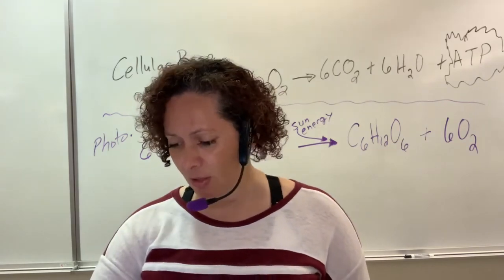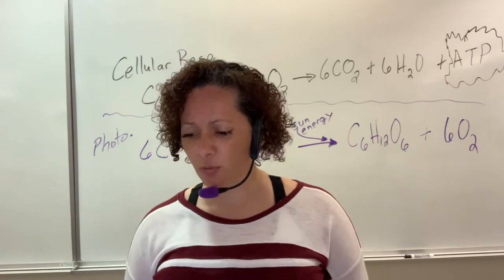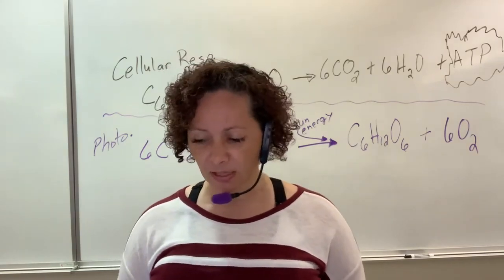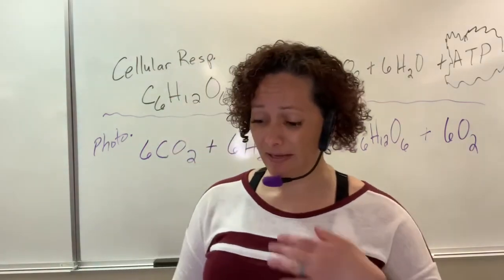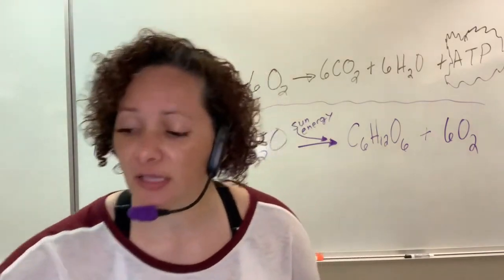And so with that, moving on to the materials. It says you're working in groups of 3 to 4. Really, you're going to be working in probably groups of, it really depends on which campus you're at, most likely. Excuse me, hiccups too. It gives you a list of all your materials.